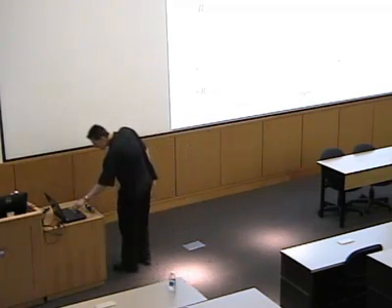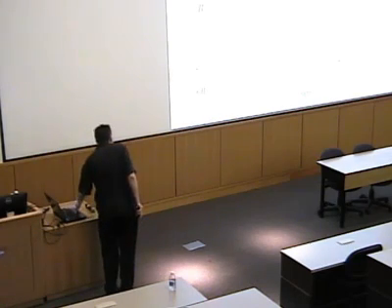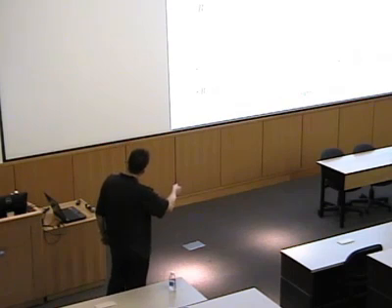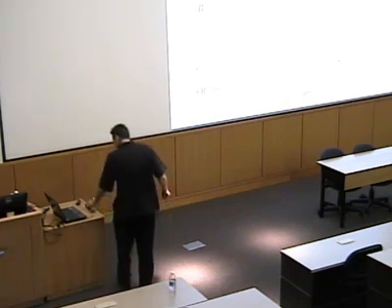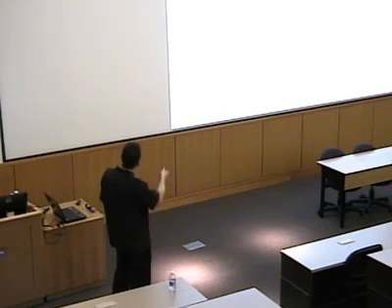So we can, again, look at this by using my picture here, my state diagram, which makes it, I think, easier to understand what's going on. So this is the example here. This is an example for the first part of this equation, where we have mixing between J and K. So again, we're looking at the transition from the ground state A to the excited state J. That's the transition we want to measure.